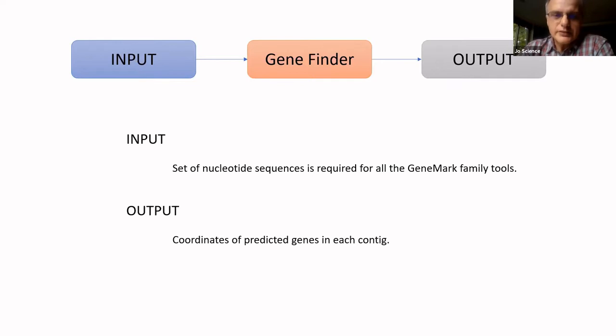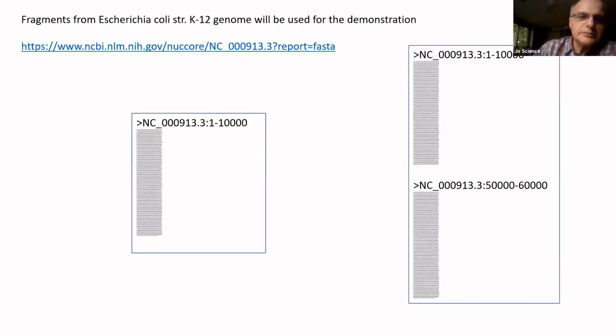This is the ideal world. Sometimes we can get better accuracy if we add additional information, but this is the base level which I will be talking about right now in the presentation. I will be switching between the presentation and the web interface, demonstrating how a sequence runs.